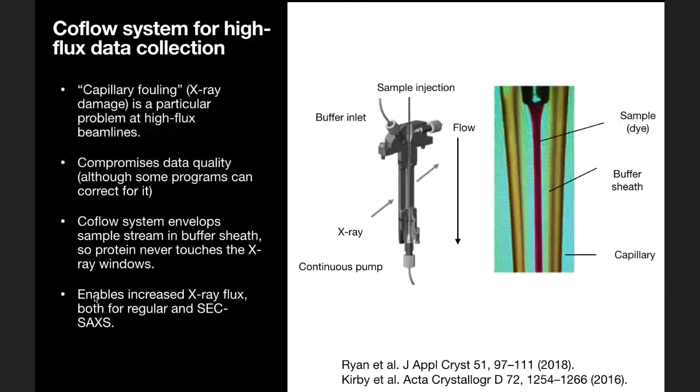And I believe BioCAT has this now as their standard mode for SEC-SAXS, although we've been running the co-flow standard for about 2 years now. So yeah, great. So you won't have to worry about capillary fouling at BioCAT, hopefully.